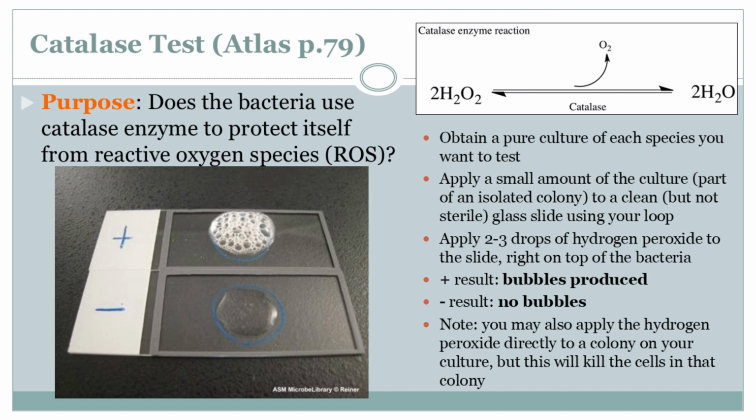And one of the tests they use involves something called the Catalase Test. The Catalase Test. Sounds intense. What's that all about? Well, it's actually pretty straightforward. It all boils down to bubbles. Bubbles. We're talking about identifying invisible bacteria, and now we're on to bubbles. Yep, it's all connected. You see, some bacteria produce this enzyme called catalase. Enzyme, catalase. Taking me back to high school biology here.